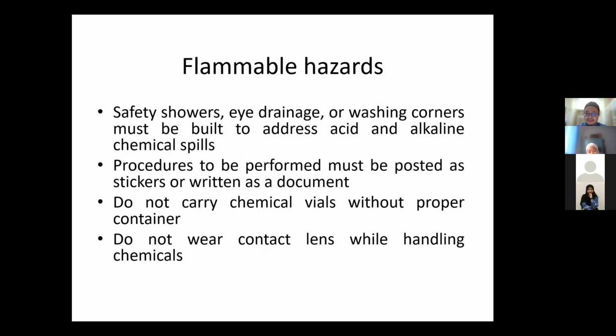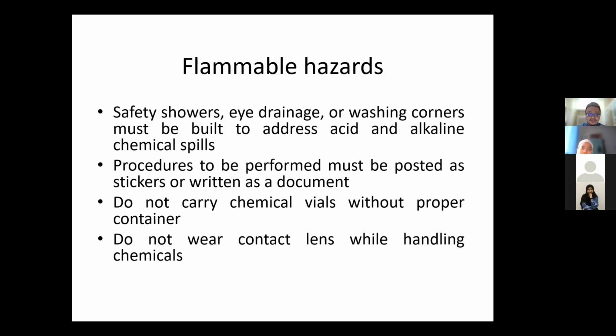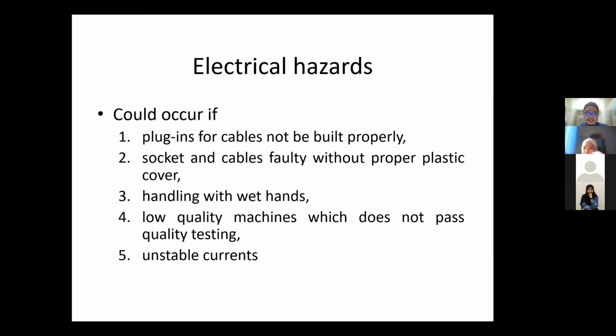Biological, chemical, and now we come to the flammable hazard. Again, safety showers, etc. Do not carry vials. Why does this seem the same? Do not wear contact lenses. Chemical hazard, flammable hazard. Do not wear contact lenses while handling chemicals. And then electrical hazards could occur if plug-ins for cables are not built properly, faulty sockets and cables, or you handle things with wet hands, or use low quality machines, or if there are unstable currents.